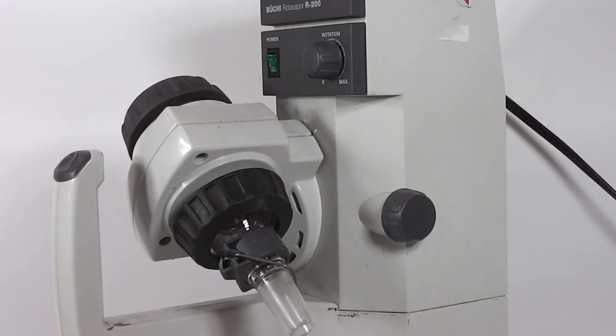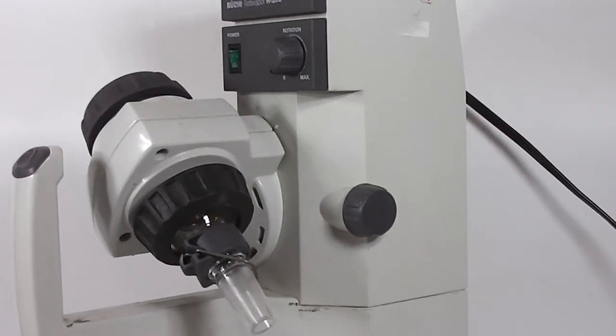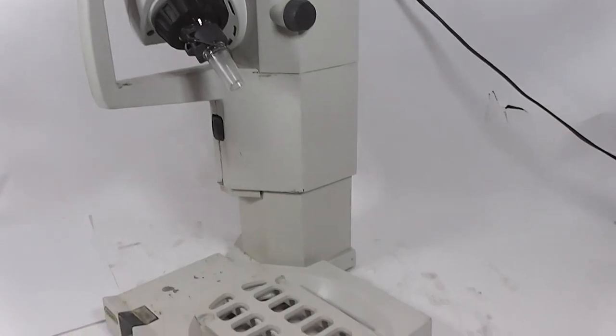That's the used Bucci Rotovapor R200. Here we are, here we go.